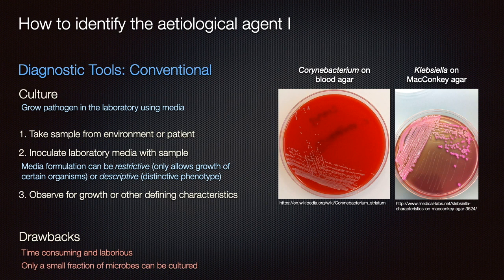This growth media is usually some kind of nutrient formulation tailored to a specific organism or, more commonly, class of organisms. In some cases, a generic growth media can be used, and specific phenotypic characteristics of the organism can be used to determine the presence of the pathogen. Those phenotypic characteristics may be a particular type of colony formation, color, size, or growth rate.